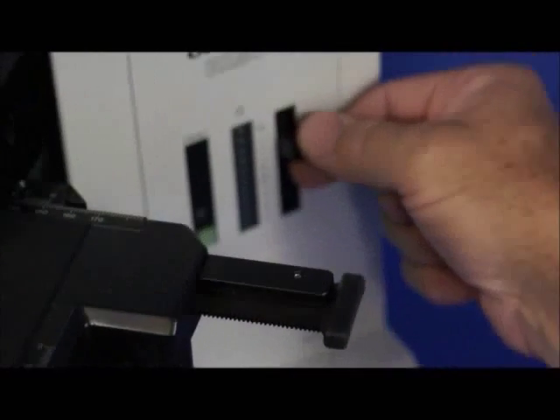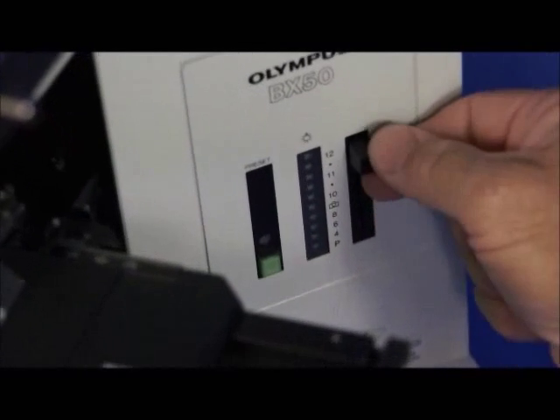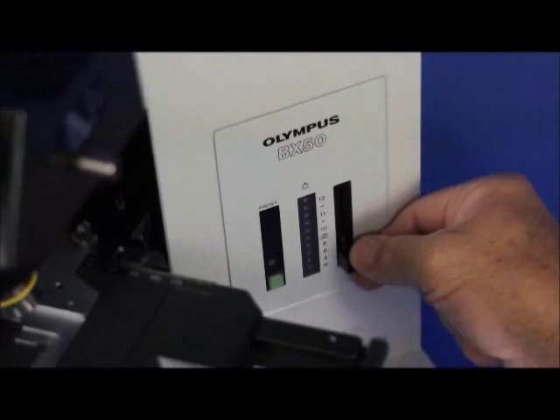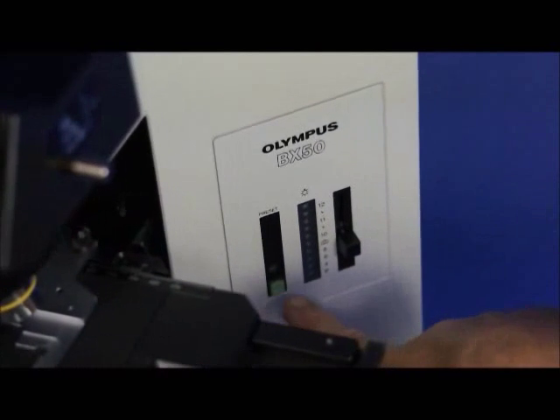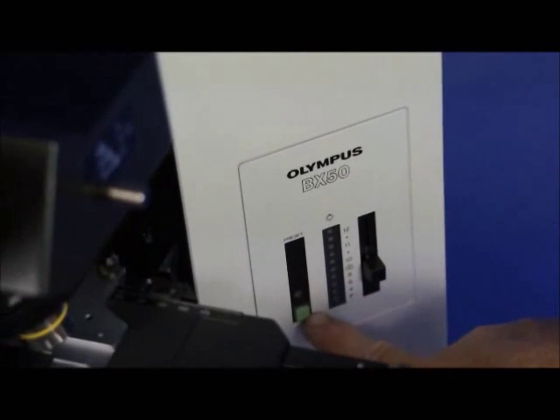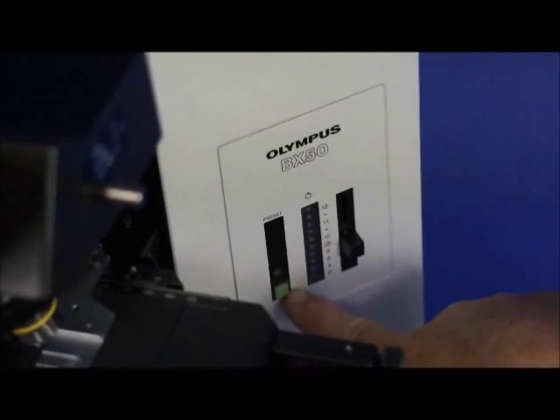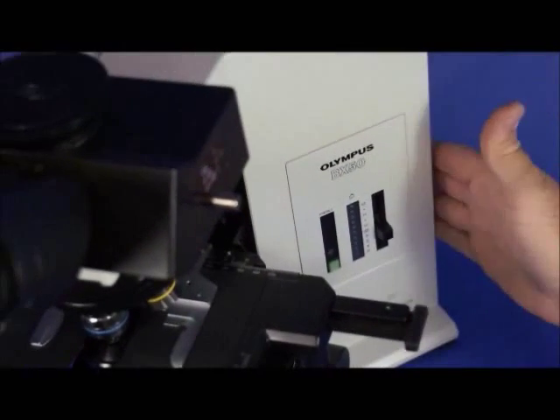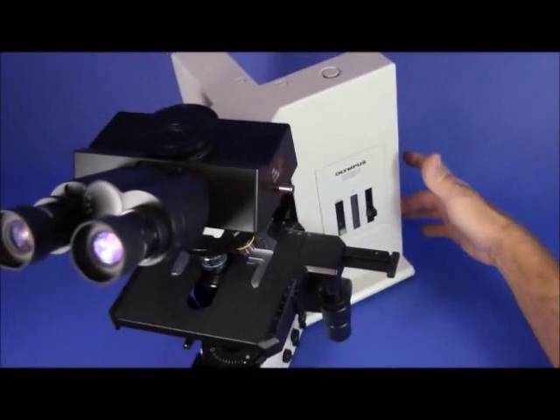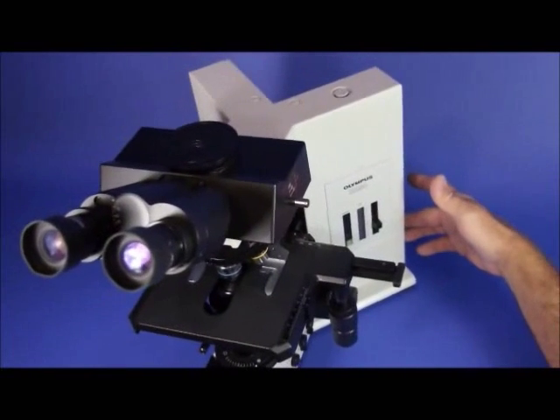Moving back just a little bit, you have an intensity control knob for controlling the intensity on this 12 volt 100 watt halogen lamp. And you also have a preset button which allows you to preset the intensity at a desired position so that when you turn the microscope on each time, it goes to that pre-designated intensity.